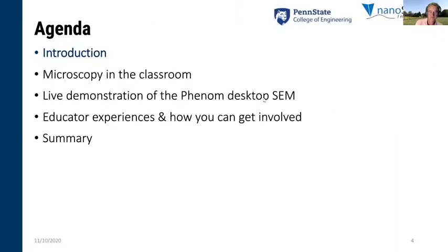All right, if we can advance. The agenda for today's webinar we're going to follow is right here. This is the introduction period, obviously. Dr. Gray is going to be talking about microscopy in the classroom. He's then going to do a live demonstration of the Nanoscience Instruments Phenom desktop SEM. We're then going to go to our panel and talk about some educator experiences using remote access and how you, as the people who are attending today, can get involved. Some of you may have already. And then we'll do a quick summary.